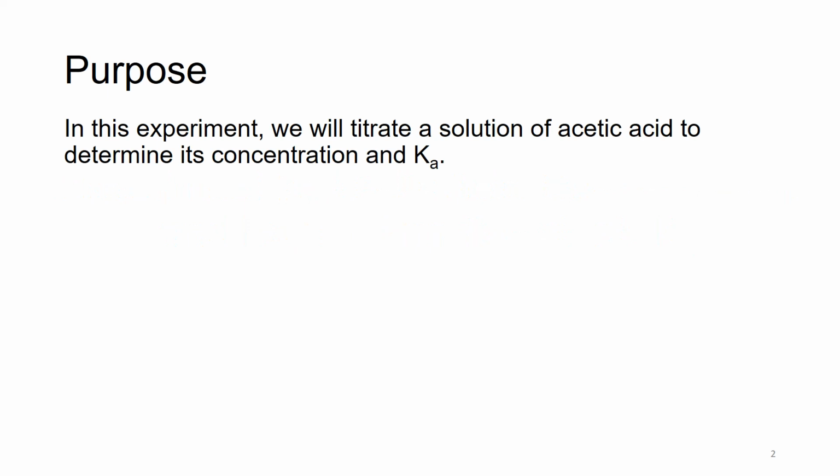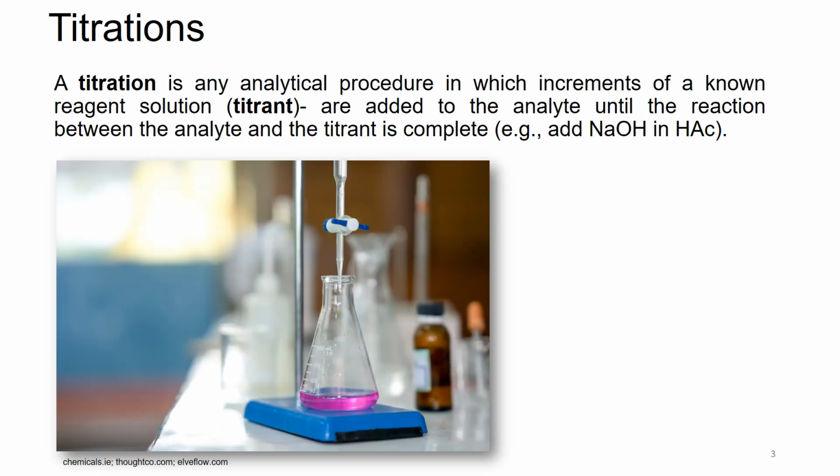Experiment number 2. Acetic acid concentration and equilibrium constant K sub A. In this experiment, we will titrate a solution of acetic acid to determine its concentration and K sub A.